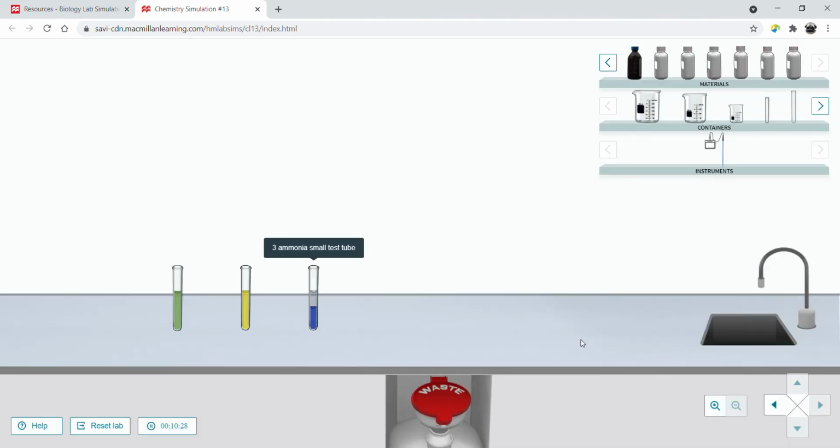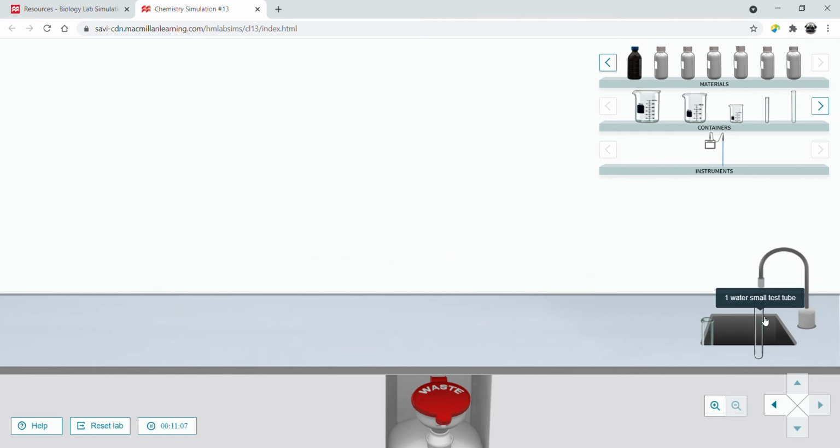And there you go. So you want to record these colors in table 1 and then refer to page 2 under the background where it says examples of pH indicators and the bromothymol blue, as far as the colors that the color change and how it does that, what the pH is according to the color that it turned. All right, very good. Okay, we're gonna clean up. You would do this in a wet lab. When I say wet lab, I'm referring to when you're actually on campus and playing with all this cool stuff. I'm gonna put that in there, and that in there, we're gonna put that in the sink. Okay, let's get back to the water.